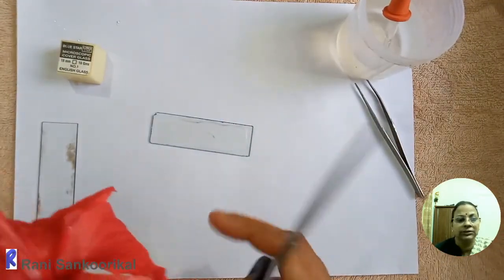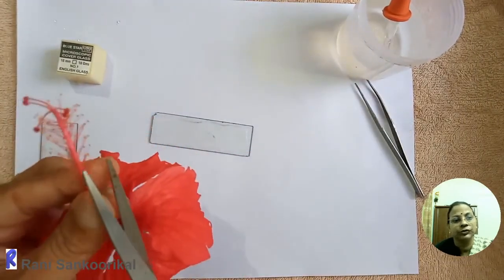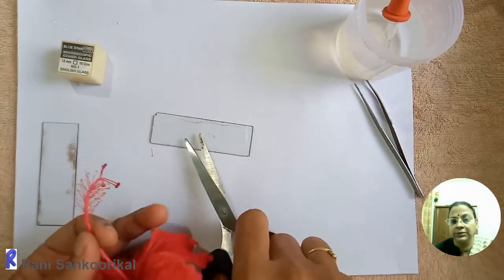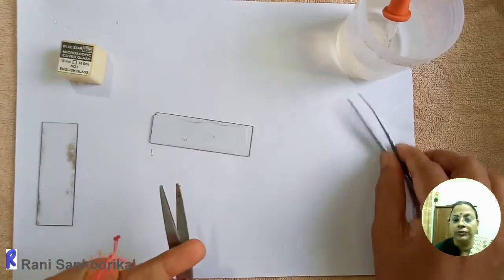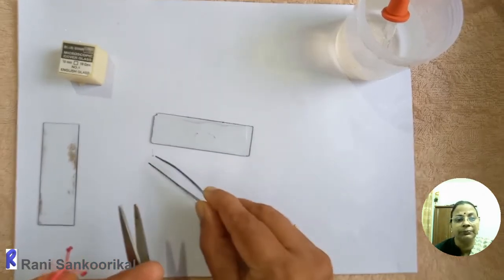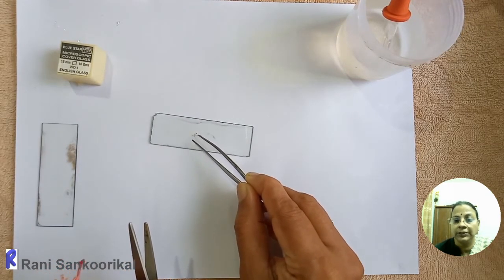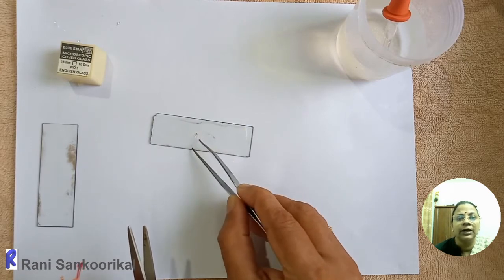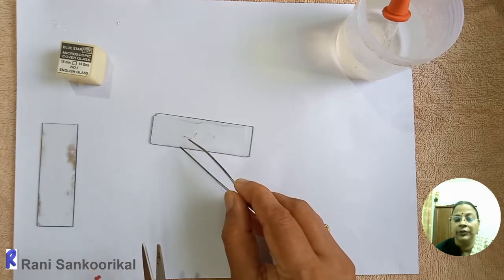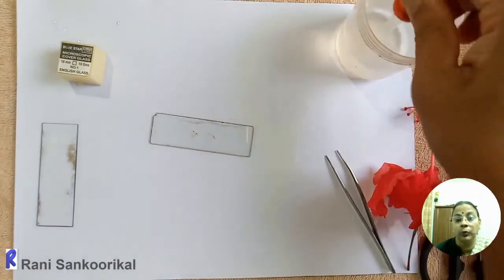With the help of scissors, you can remove the stamens. So you can take the scissor and cut the stamens and dust it onto the clean slide. So for this you need to separate 1 or 2 stamens and place it into the center of the slide. Carefully have to do it, and with the help of needle you can tease the anther. Otherwise sometimes the anther lobe will not be open.